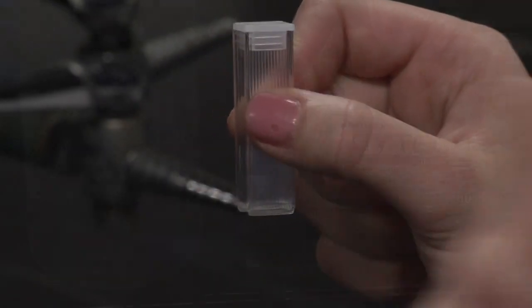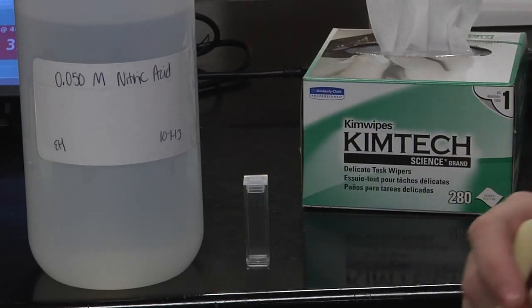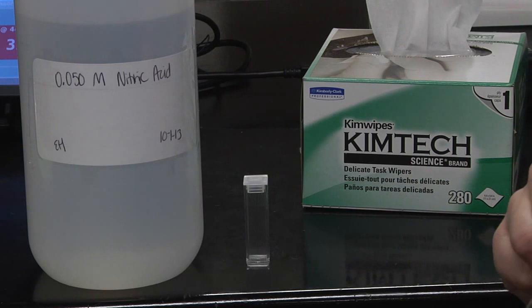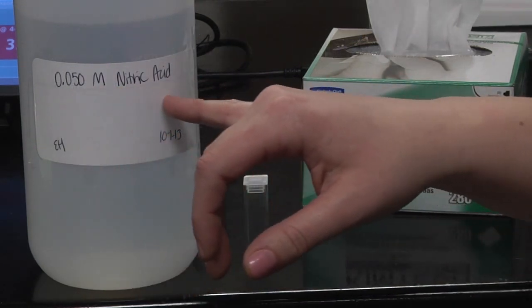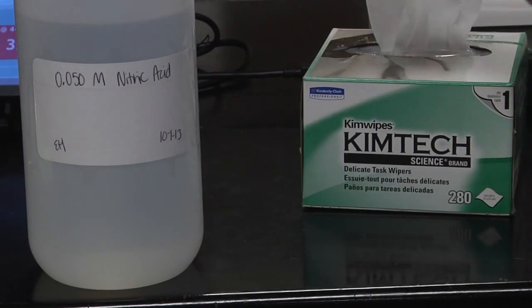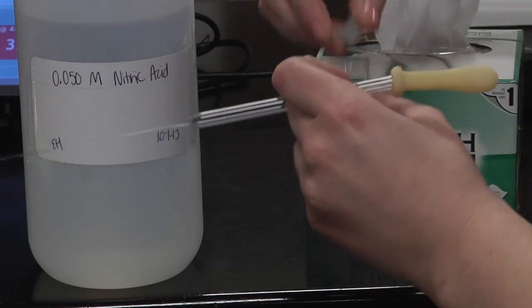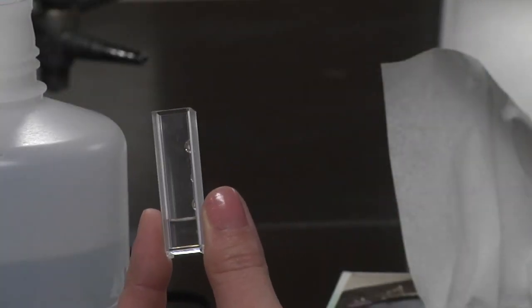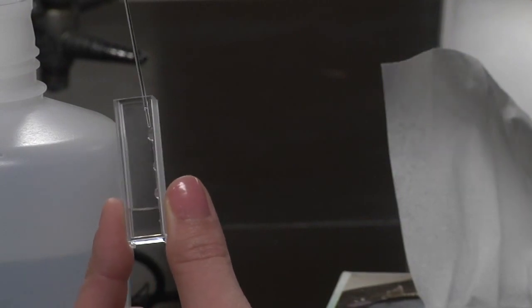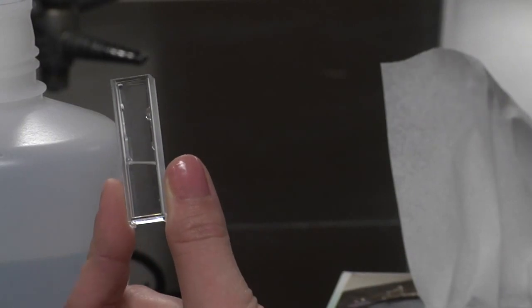Before we calibrate the SpectroVis, we first have to make our blank. To do that, we're going to use 0.05 molar nitric acid and a cuvette. They only need to be about three-fourths of the way full. Also, you want to try and avoid any bubbles. The best way to do that is to pipette it down the side of the cuvette. If you do get a bubble in there, just stab it with the pipette and it'll go away.